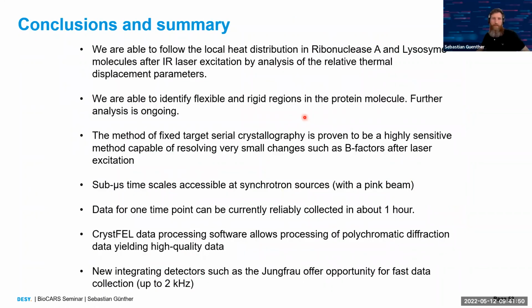So to come to a conclusion at this point, with our fixed target methodology, we think we can follow the local heat distribution of ribonuclease A and lysozyme after the IR laser excitation. We can see more flexible and less flexible regions as judged by changes in B factor.